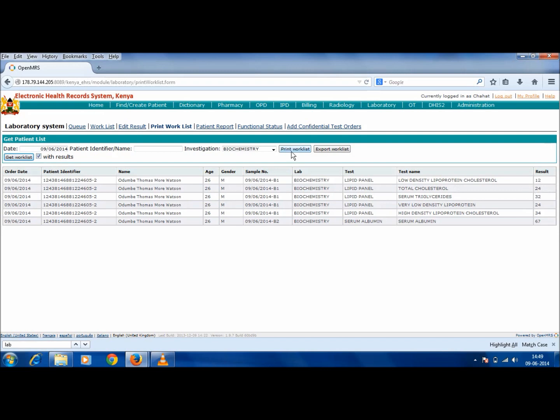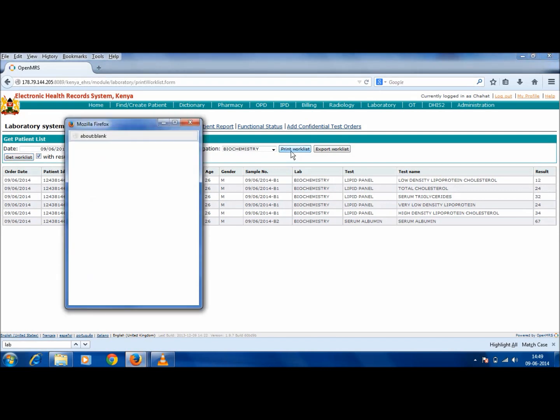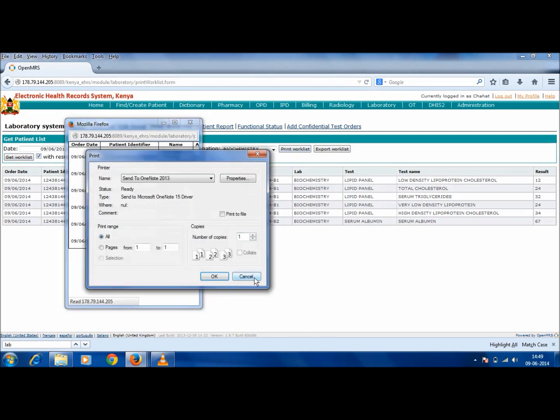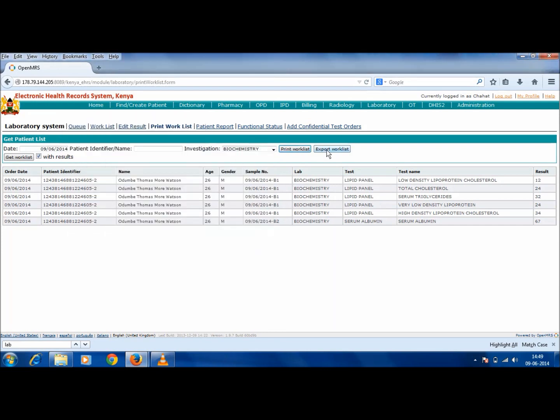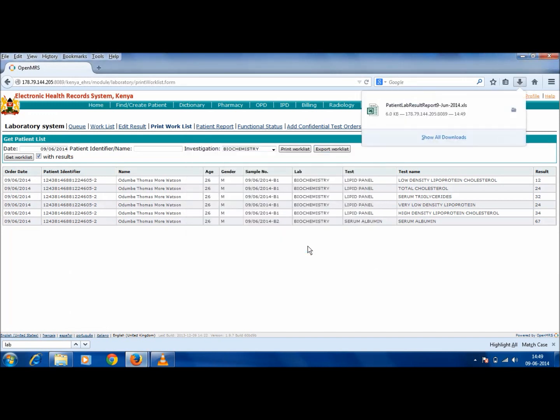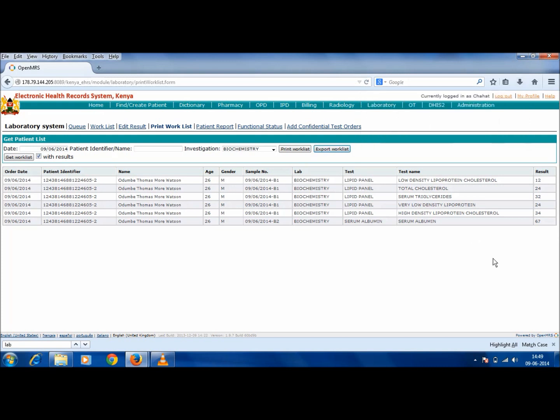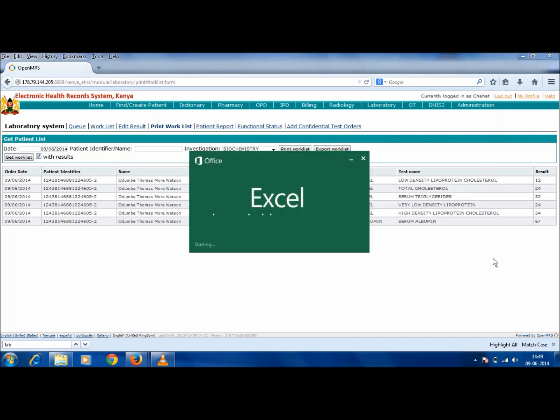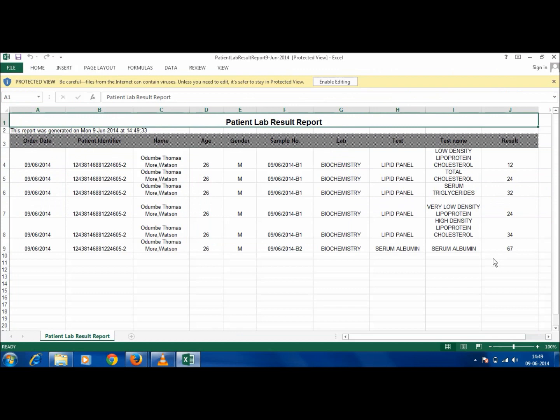This Work List can be printed or exported into an Excel sheet. A printout can be taken and documented. This is basically for the purpose of documentation, as it has been noticed that many people would like to document the Work List and the kind of results entered during the day. So therefore this Work List can be exported into Excel and a printout can be taken and documented.